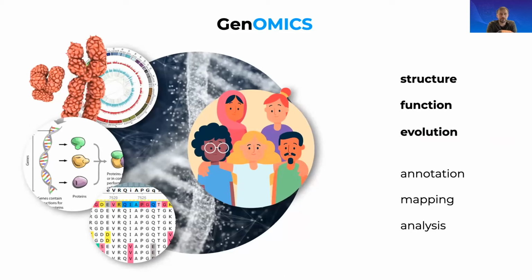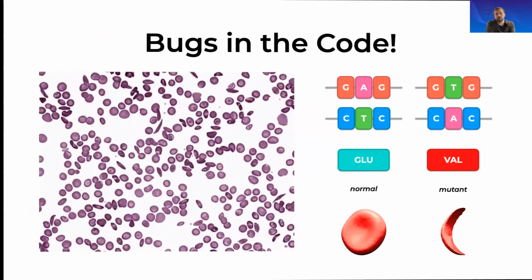For example, genes that have been annotated, we can ask questions about what these genes do, or what kind of variation in the gene sequence doesn't let them do what they're designed to do. And then we'll talk about how the next generation sequencing data that describes the genomic variation can be analyzed to identify some of those changes, some of those variants.